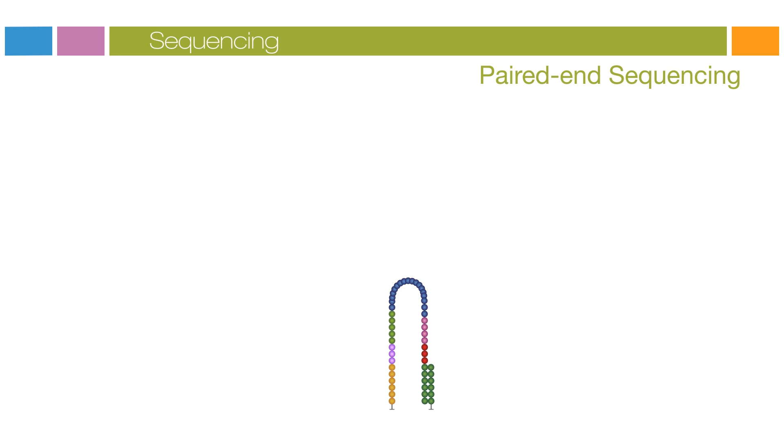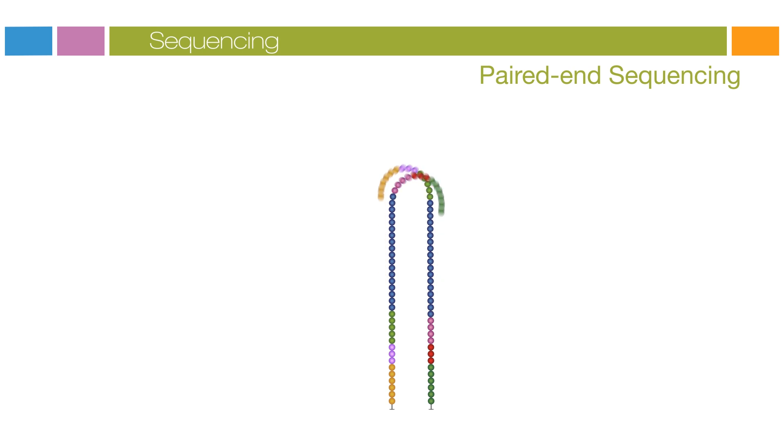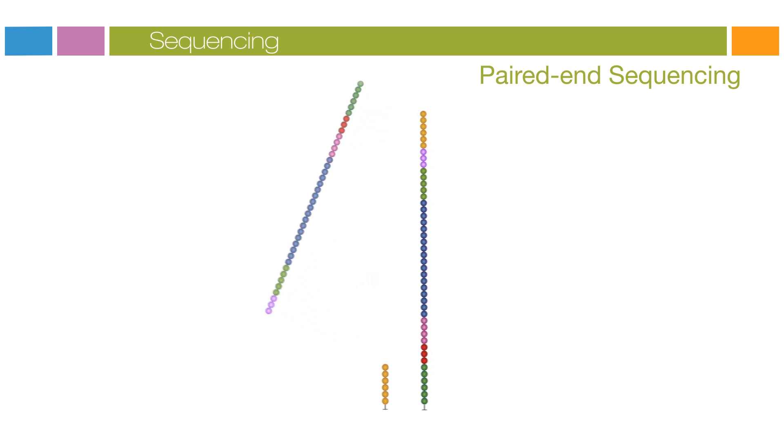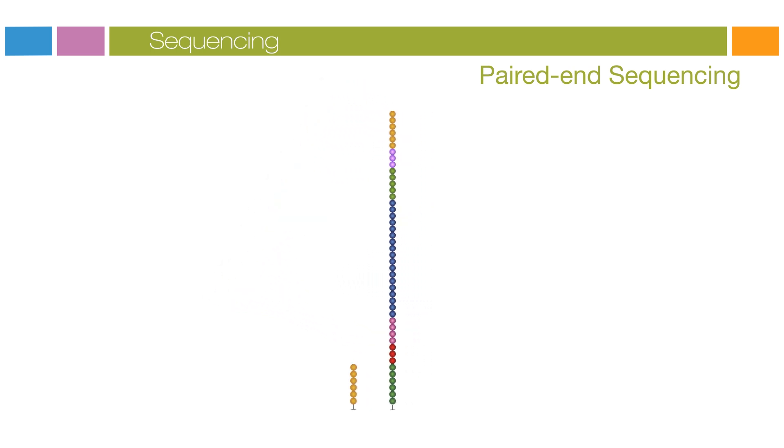Polymerases extend the second flow cell oligo, forming a double-stranded bridge. This double-stranded DNA is then linearized and the three prime ends blocked. The original forward strand is cleaved off and washed away, leaving the reverse strand.